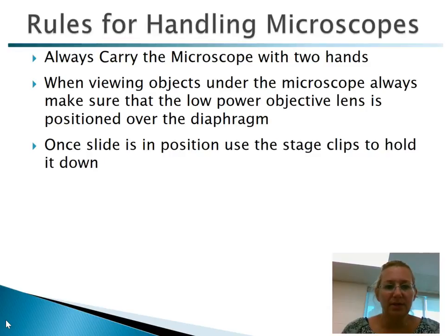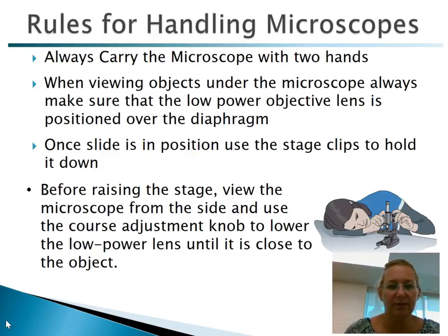Once the slide is in position, make sure you hold it down using the stage clips. You don't want the slide to be moving around, especially if you've just got it into focus and you're doing a microscope drawing. You'll have to start redrawing your image.